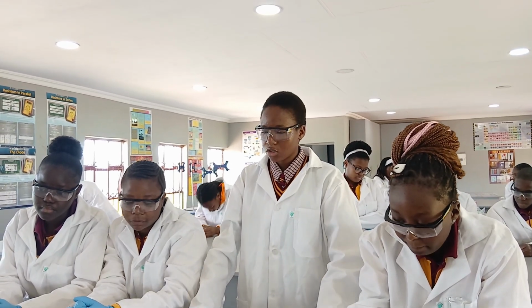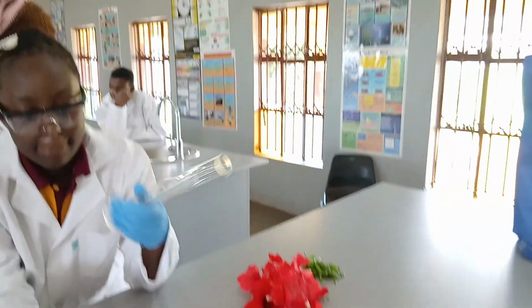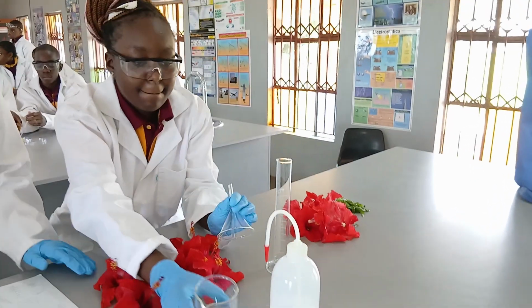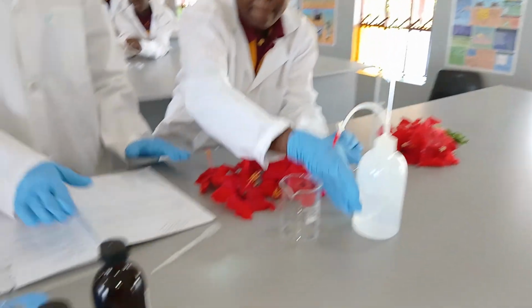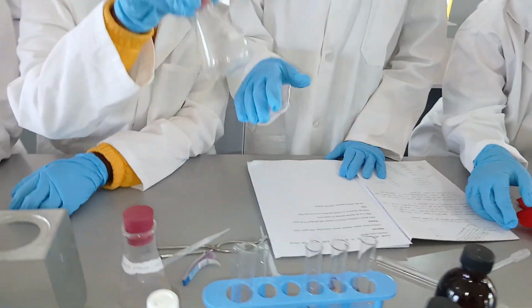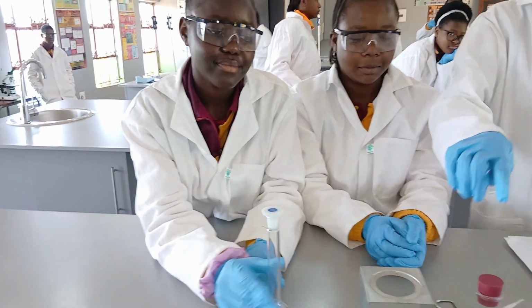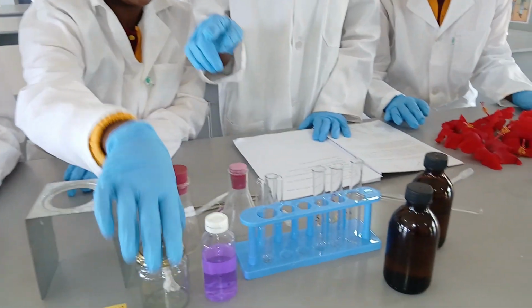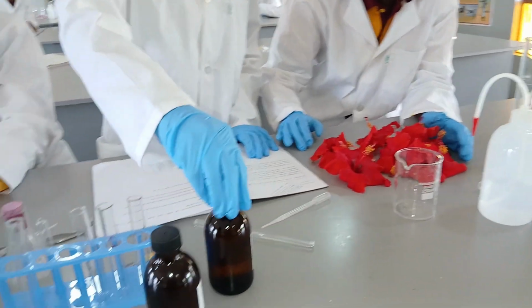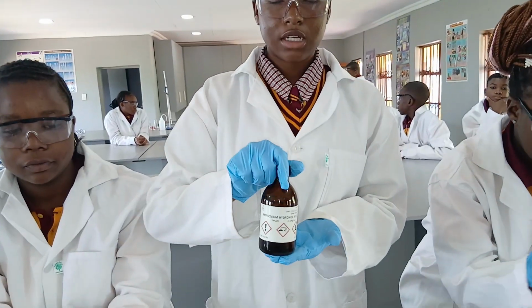So some of the materials or tools that we will be using to make our own hibiscus flower indicator are: our hibiscus flowers, our measuring cylinder, our funnel, our beaker, wash bottles, and our droppers. We'll also need a stirring rod, our test tubes, our conical flask, our spirit burner stand, our solution, which is hydrochloric acid, our spirit burner and spirit, including our matches, and some of the other solutions, we can have our acetic acid and ammonium hydroxide solution.